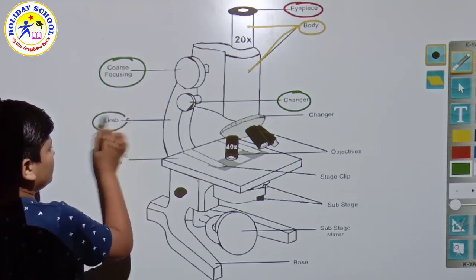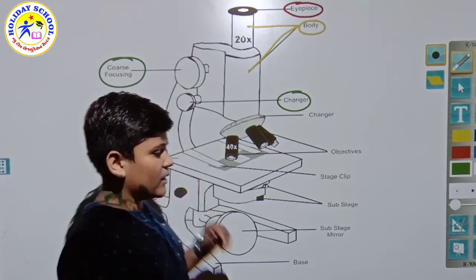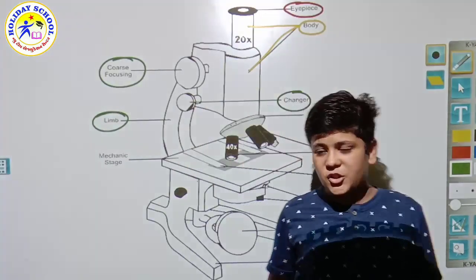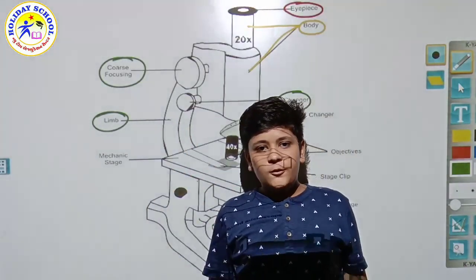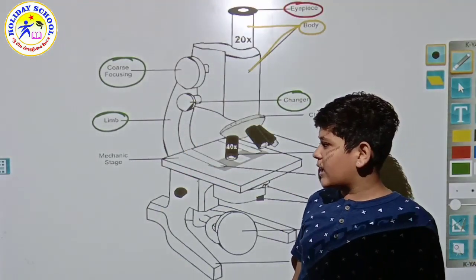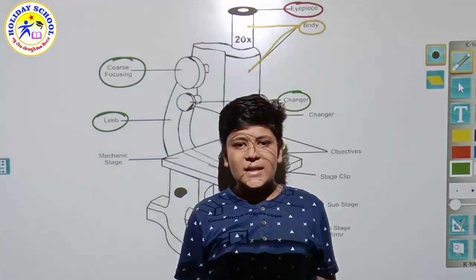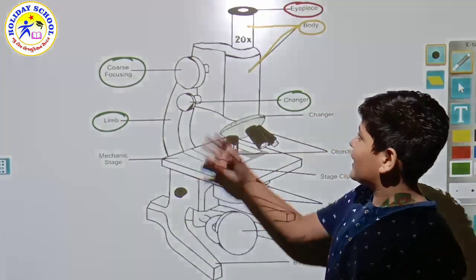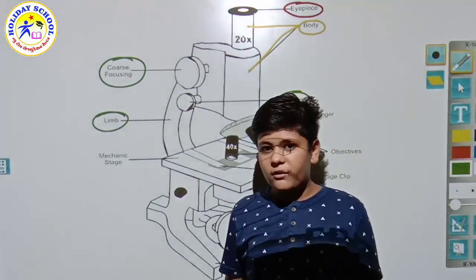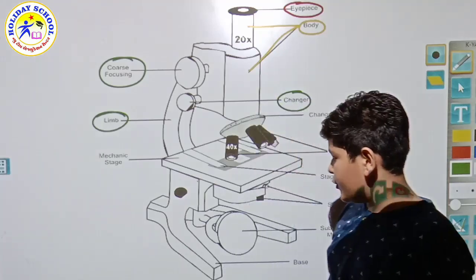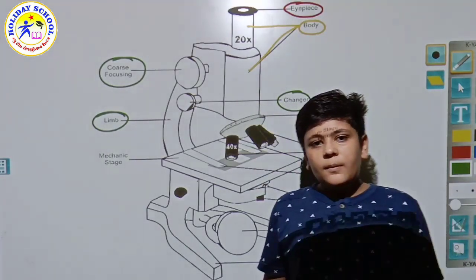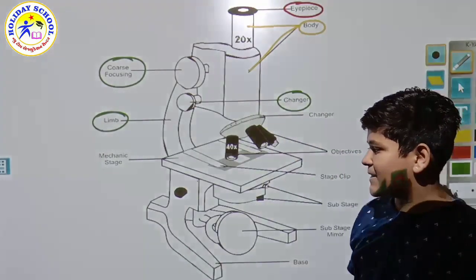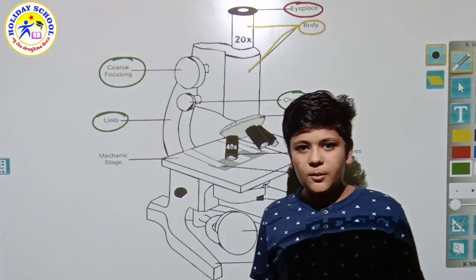This is the limb. The limb is a handle-like structure. You can see here, friends, the work of the limb is to handle it easily. If you handle at the bottom part, the body will damage if it falls. If you hold at the base, it will also fall and damage. So the limb is given to handle the microscope.